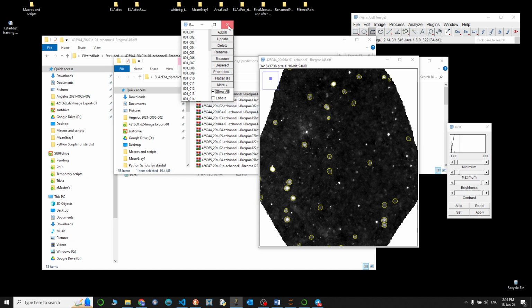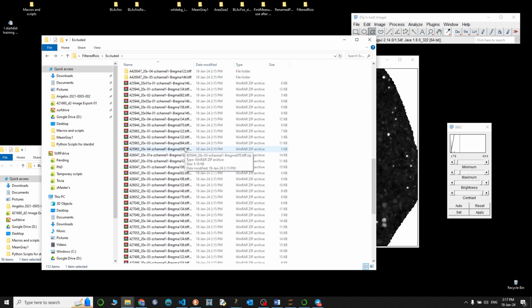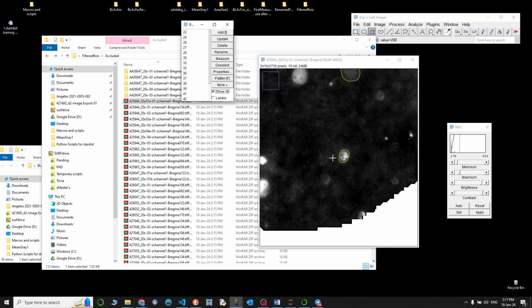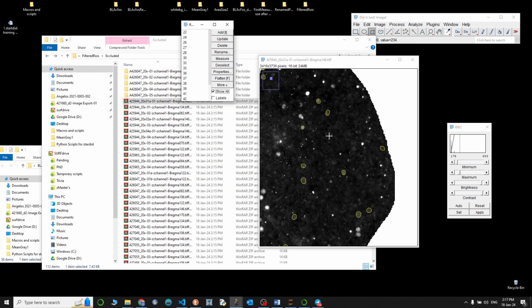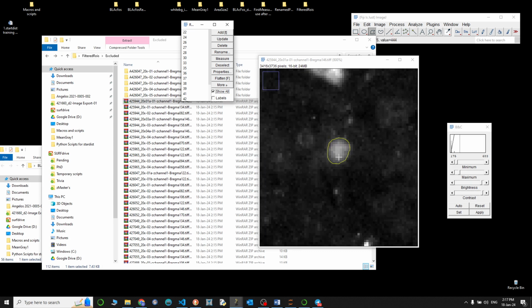But now, if I close this and discard the regions of interest, and if I insert the excluded ones, you will see which ones were not filtered in. And these are the ones that were not filtered in. So most of them, as you can see, are ones that are either too small, probably, like that one, or not that bright, as in the rest of the cases. This looks more bright. I don't know which one of the cases it might fall under.